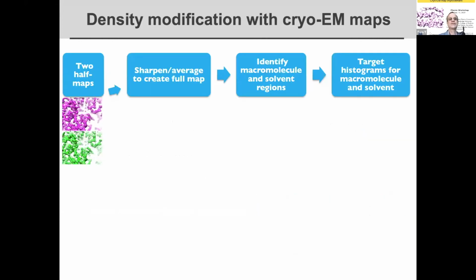So here's the procedure that's actually done in Resolve Cryo-EM. Let me see, are there questions I need to answer before I go on to here? There is one question. Well, there were a couple of questions.